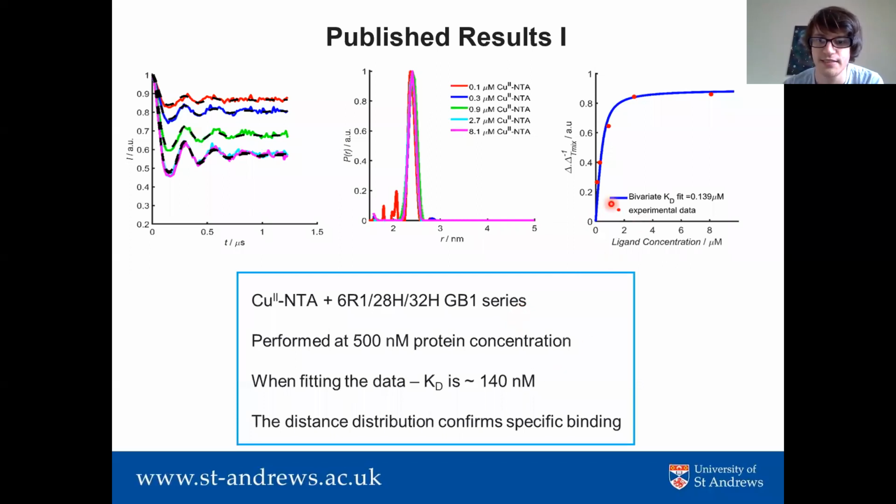When we fit a KD to this saturation function, we found that we had a KD of 140 nanomolar. So the affinity was obviously much higher than was previously speculated. And this was at odds with the previous findings.